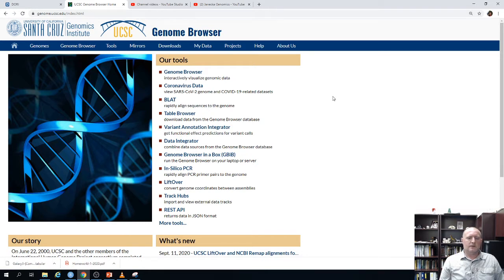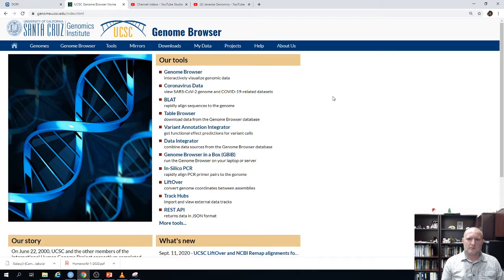I'll cover how you can access information, what the different tracks are, how you can optimize the way that you visualize the data, and also how looking at all this information on a particular genome and having a visual along a chromosome can help you recognize certain patterns and the importance of different sequences.